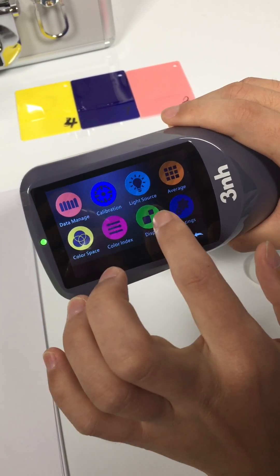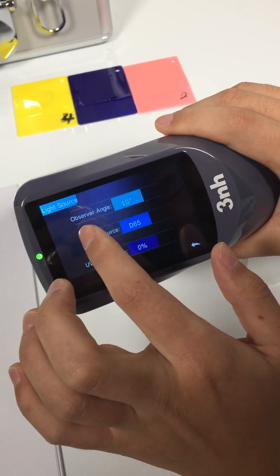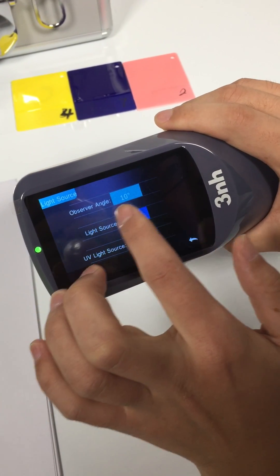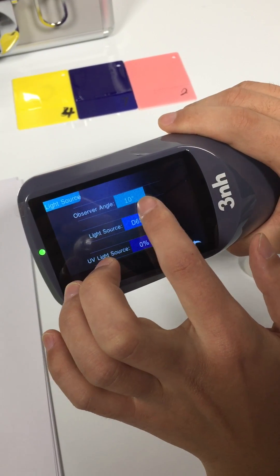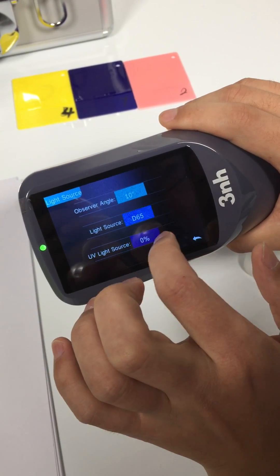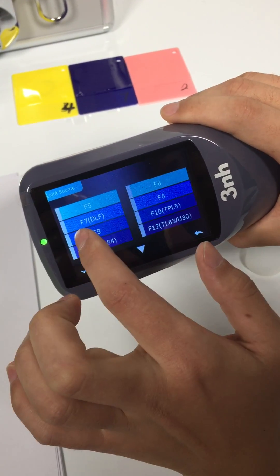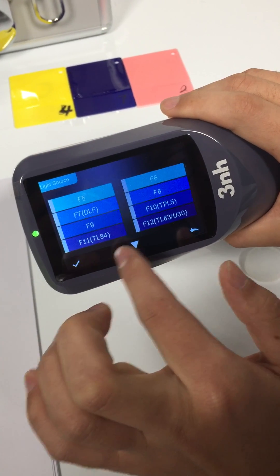Calibration. Light source — you can choose different light sources here. Observer angle — you can change the observer angle between 10 degree and 2 degree.